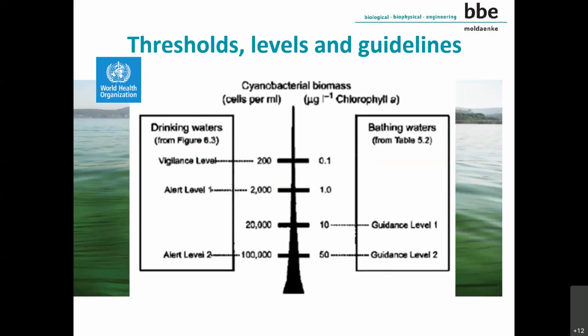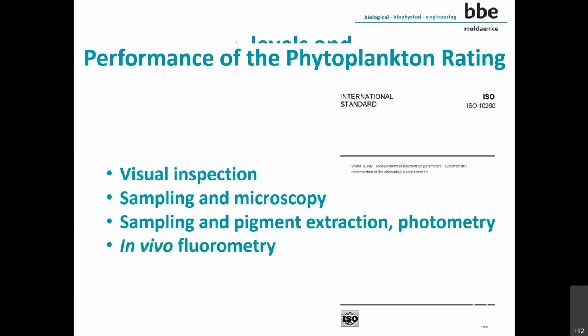What is allowed, what is recommended, it's not very clear, but these numbers are given by the World Health Organization, and you can see here on the right side some levels of microgram chlorophyll A inside of the water, of bathing water or drinking water. So some recommendations exist, they are not very clear, but it is, let's say, a rule of thumb that you can use, for example, when you check water for quality. So there is something which you can use, for example, when you use instruments for determination of the microalgae content.